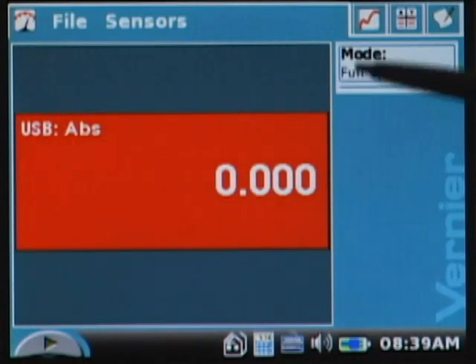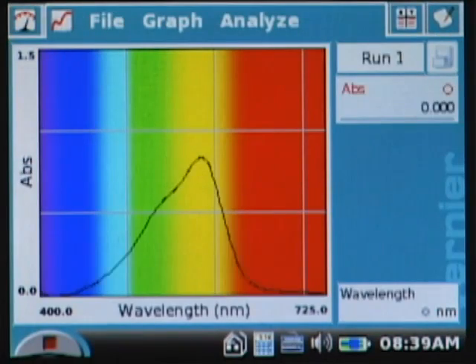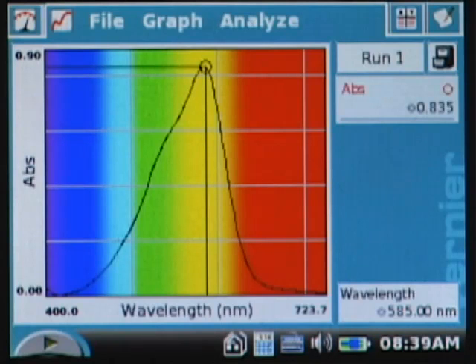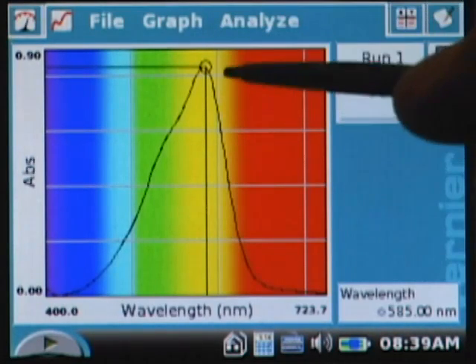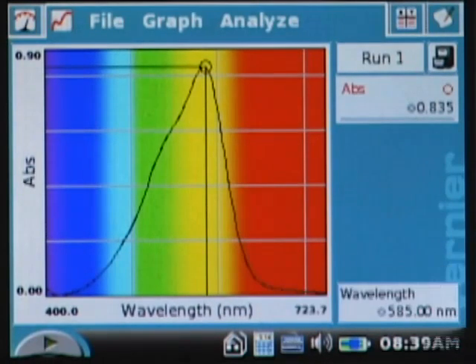Notice on the LabQuest app screen that the mode is already set to full spectrum, so it's ready to go. I tap the collect button and in less than a second I get a full spectrum. I tap stop, it auto-scales, and it selects the peak wavelength. Tracking that down to the wavelength x-axis I can see it's selected 585 nanometers to use for the remainder of the experiment, and the LabQuest will remember that wavelength for the next steps.